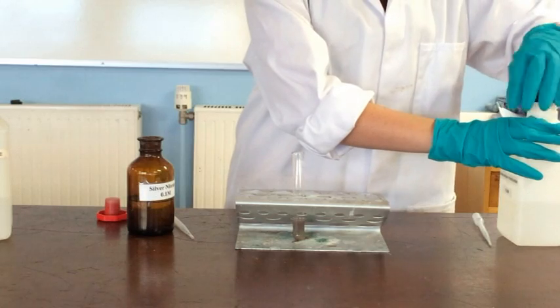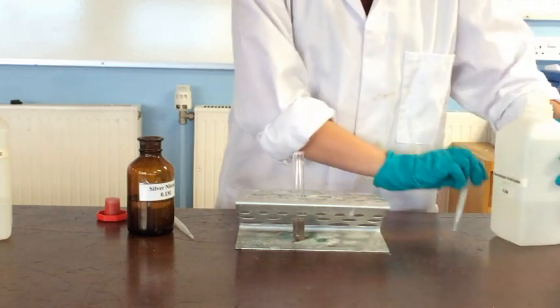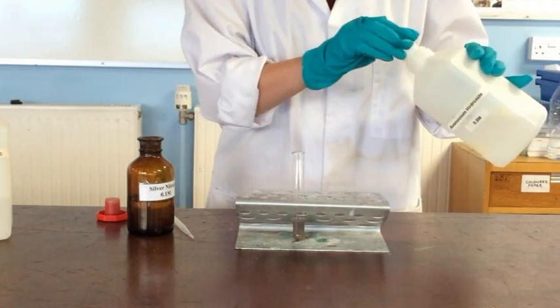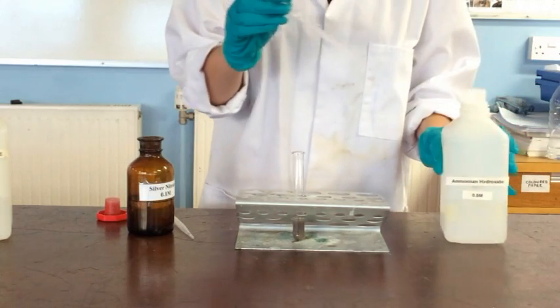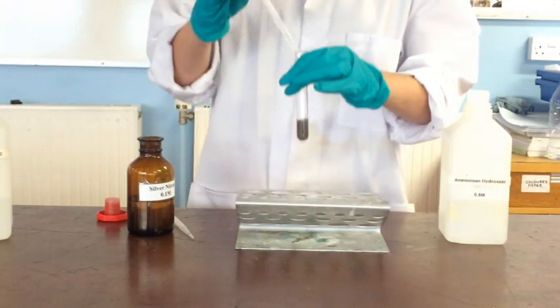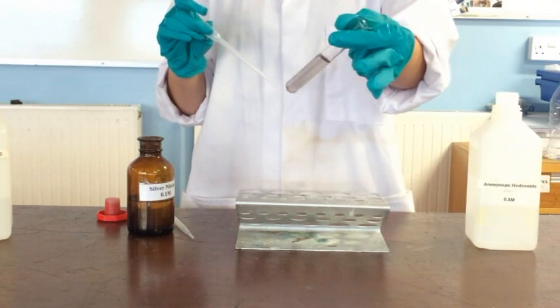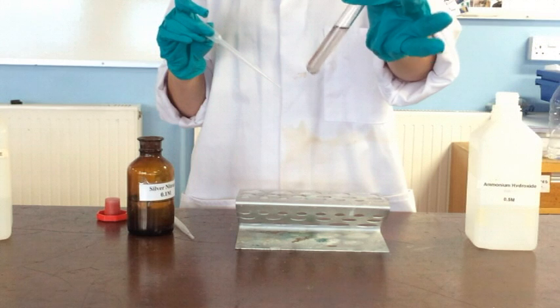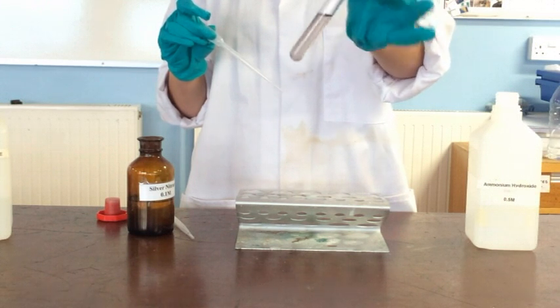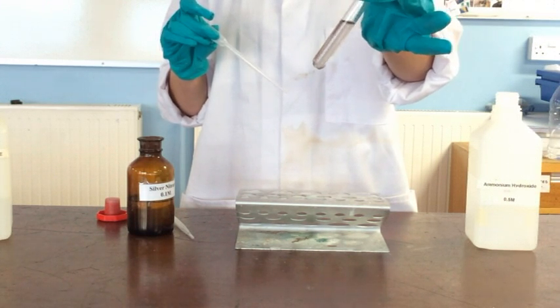Then we need to add some ammonium hydroxide until that brown precipitate just about dissolves. That is our Tollens' reagent, nice and clear now.